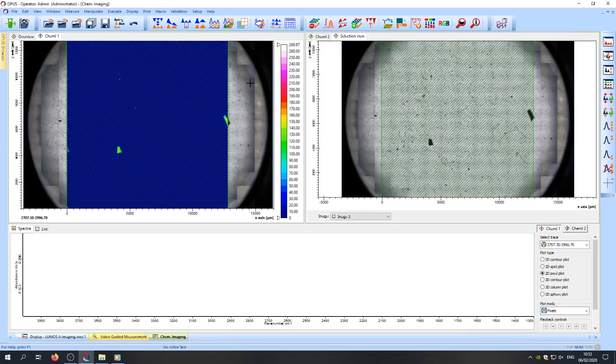After the measurement is done, we are directed to this window where we see the result of the live integration displayed for the whole measurement area. We see that there are two larger particles sticking out and we're going to have a look at them first.